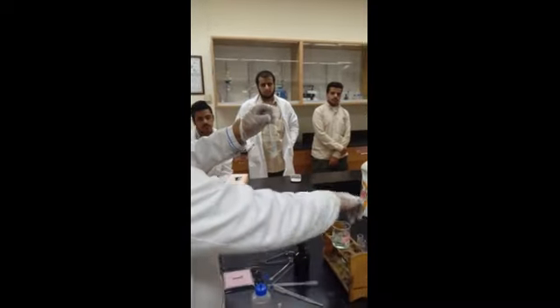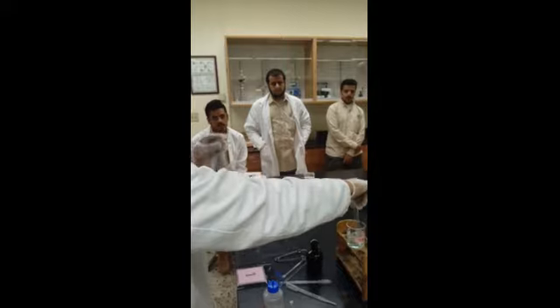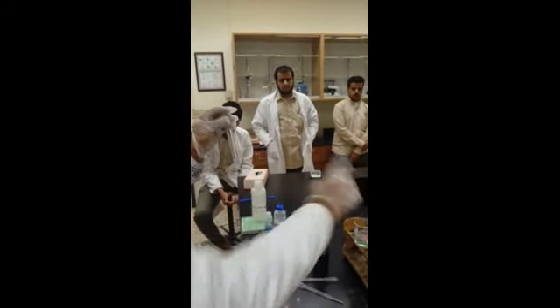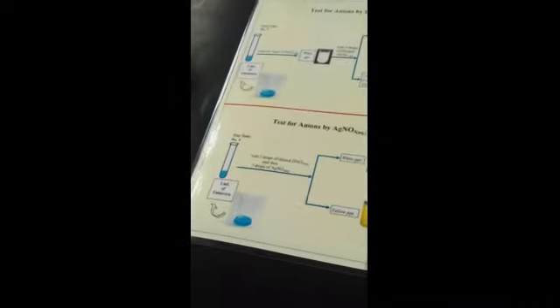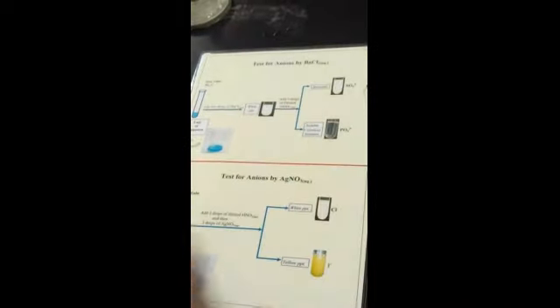Compared to this one, which one has more precipitate? This one, yes. Okay, fine. So we can consider maybe some impurity there, but it's not a clear answer. We got the answer there already. So it's almost no observation. In the second test I did not get any answer. They give you chloride or iodide, yellow or white precipitate, which we did not get, because we got the answer here already.